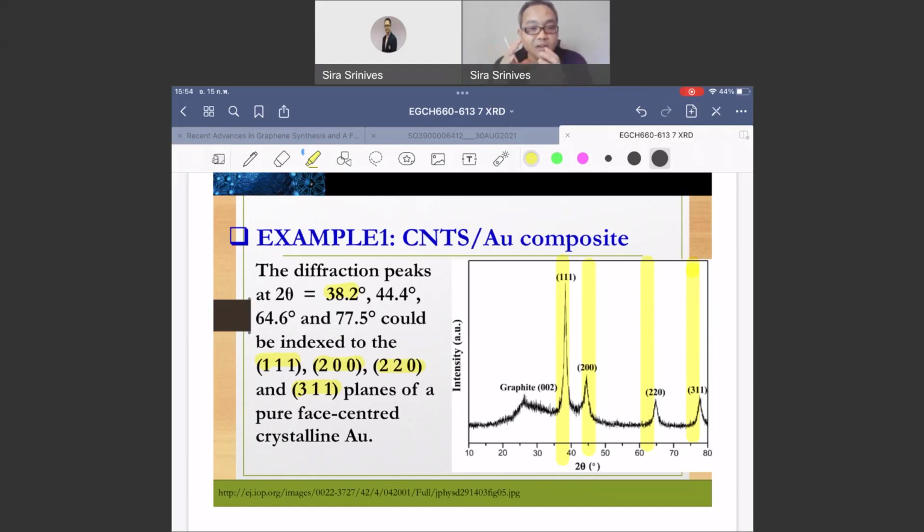So the remarkable thing about the XRD is that the signal of different materials, or the same material with different crystal structure, would appear at different spots on the x-axis. So you wouldn't have much problem with two crystal structures having signals that combine with one another and create one peak. That can happen, but the possibility is lower as compared to other types of analysis.